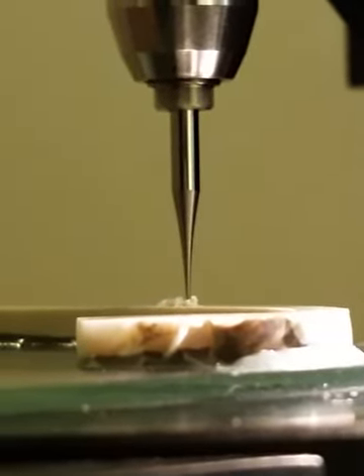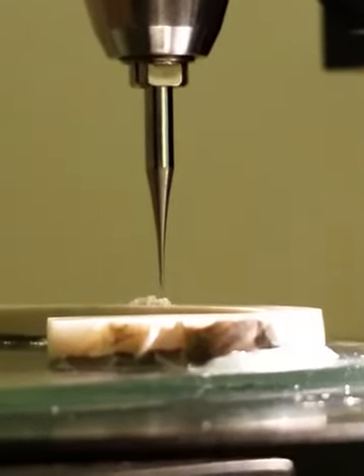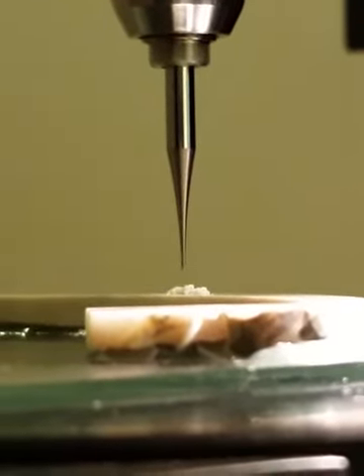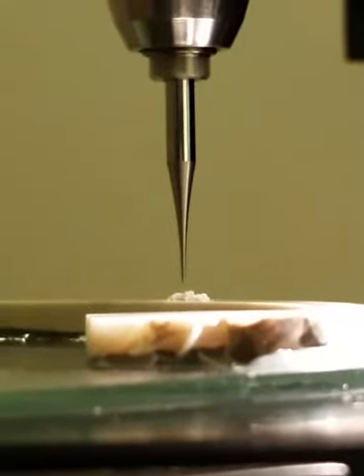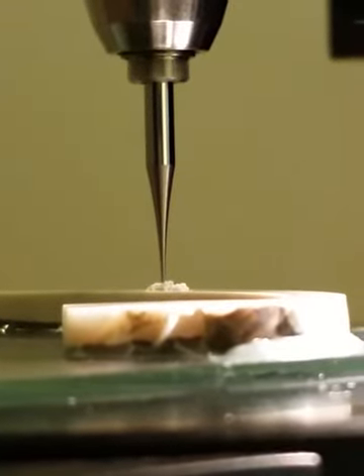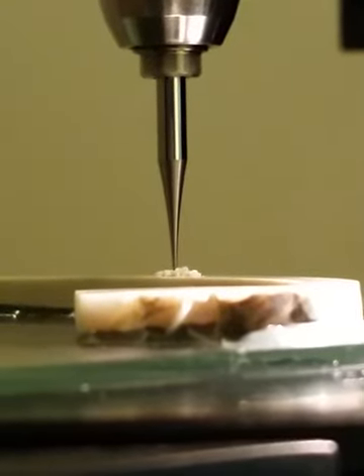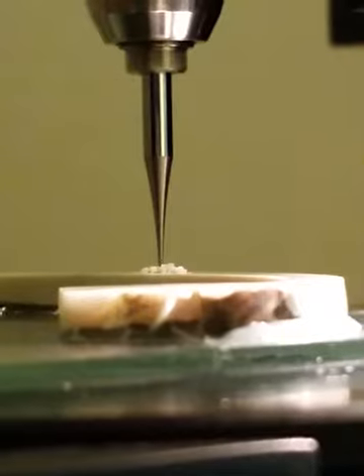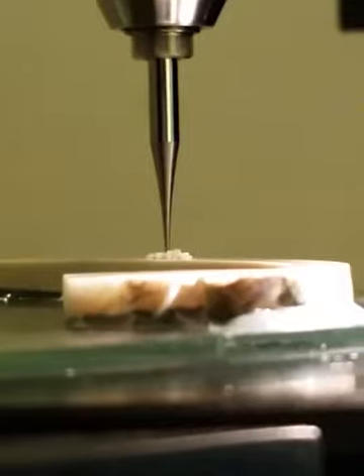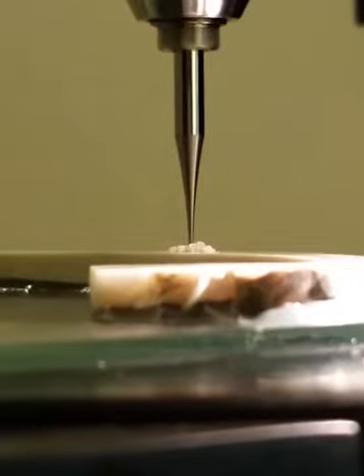At this point, I would be tempted to remove the material. Oh, okay. Actually, it just keeps stacking up. The nice thing is, I find that when it's stacked up like that, the cutting is under the powder, and so it tends to keep things from flying off. Like otoliths, it's aragonite, so it tends to be a little more poppy. So the first pass tends to splatter around. The second pass tends to be less scatter because it's under the powder. And fortunately, like I said, it's sort of a colloidal type powder. It tends to stay together.